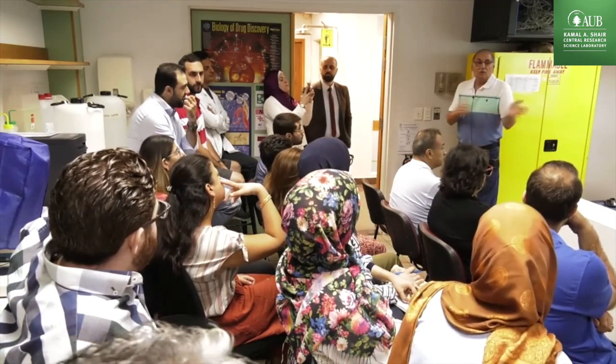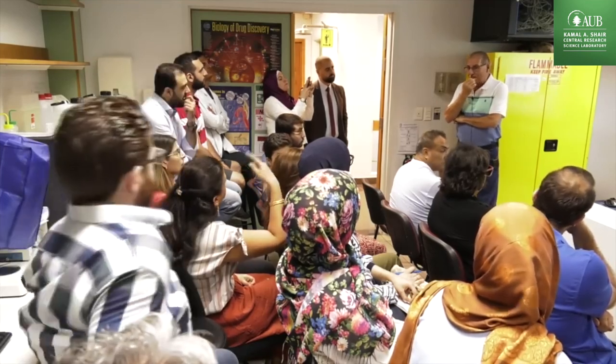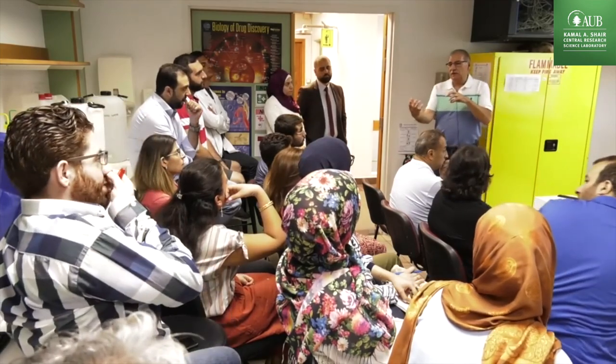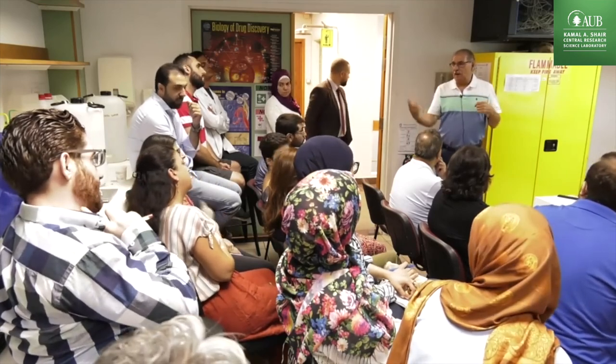All what you have seen here is at atmospheric pressure. What about the isobars? Yes, if you want to change the temperature, you have to have an oven. You just do analysis at 35 degrees C, then you raise the temperature to 100 degrees C. You can do it, yeah.